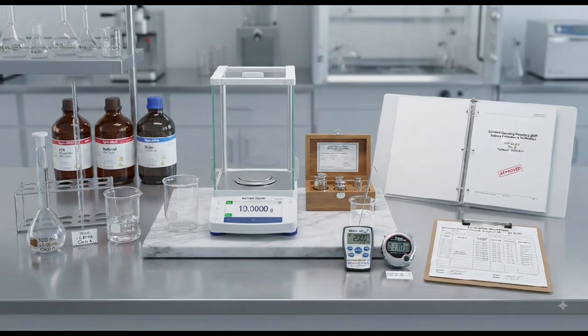Materials required. Before starting calibration, ensure that all required materials and measuring devices are available. These may include certified reference materials, calibrated temperature measuring devices, calibrated balances, timers, volumetric equipment, appropriate solvents, and the approved calibration procedure. One critical point is often overlooked. All reference and measuring devices used for calibration should have valid calibration status.